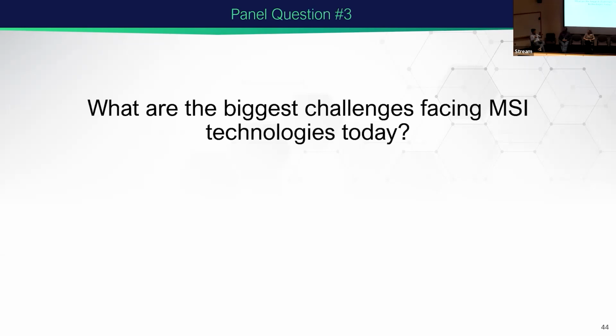So currently there is no good way. Maybe ion mobility can help a little bit, but the separation dimension is limited, maybe up to 80 at the most currently.